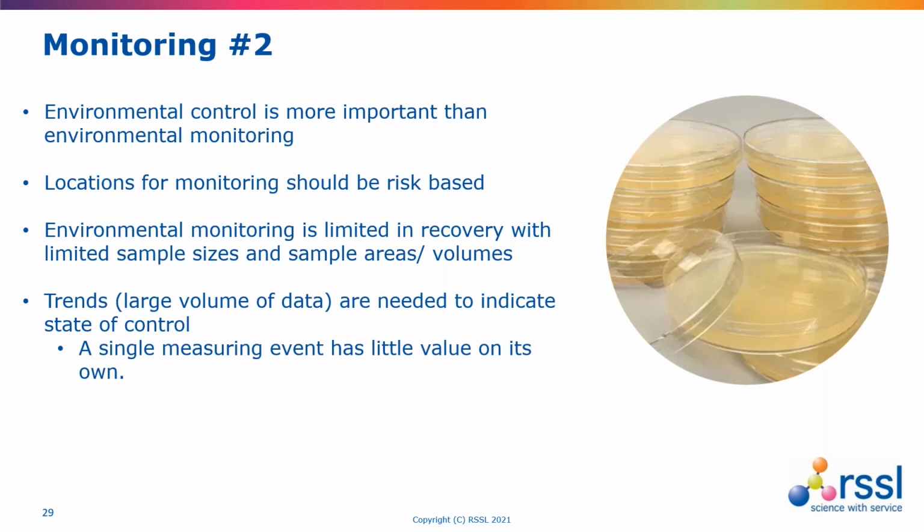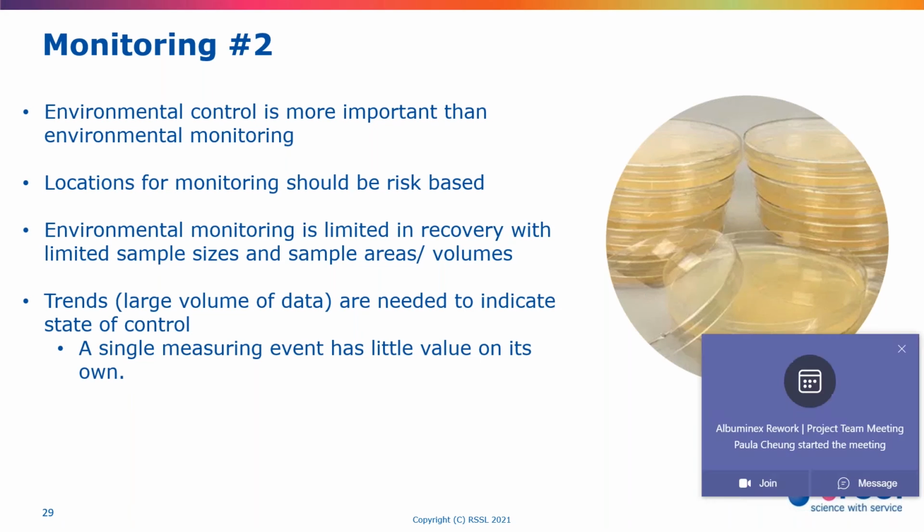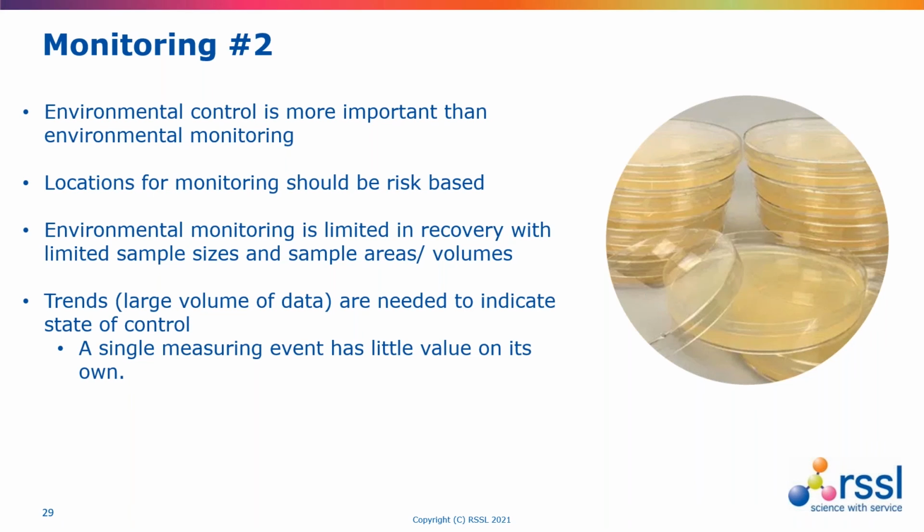So it's either based on sample sizes or areas that we can sample, or volumes that we can actually collect. And then to do with the abilities of the agar and the incubation conditions, and then the presence of organisms that are not readily recoverable, either permanently or temporarily.